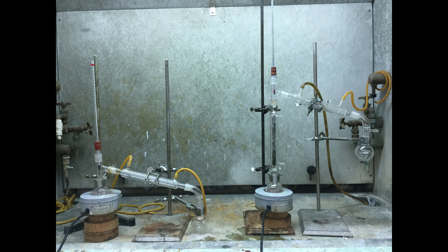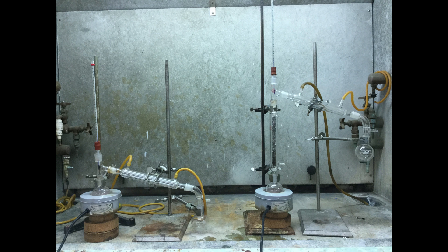The laboratory technique we will be discussing today is distillation. This method of purification is used to separate a liquid mixture. Here are a few common distillation setups, but the basic premise for each apparatus is the same.